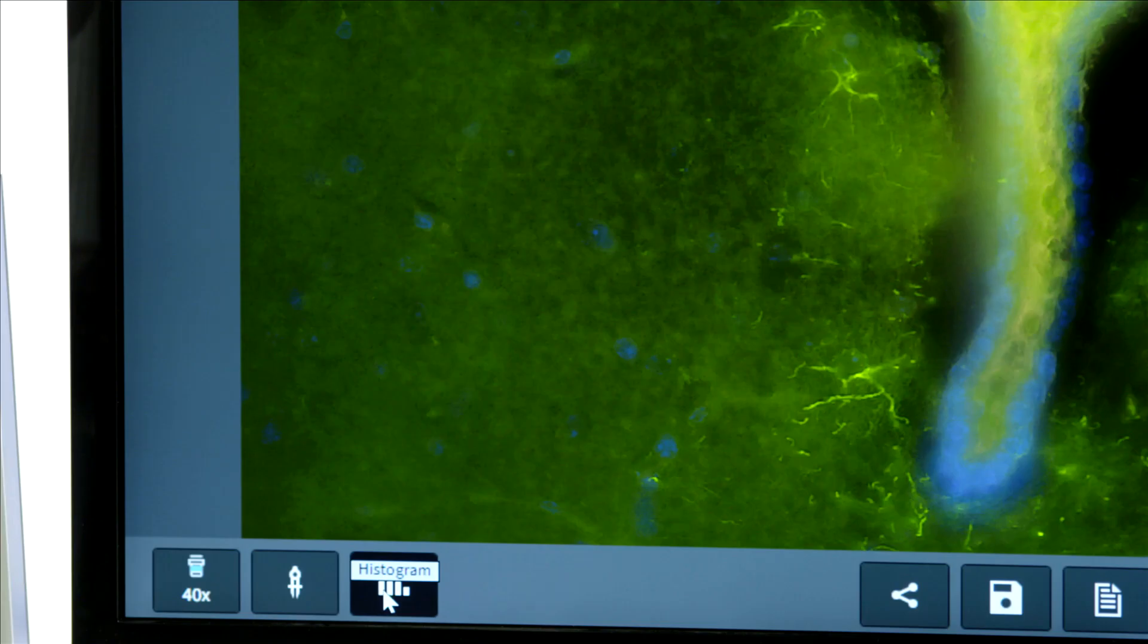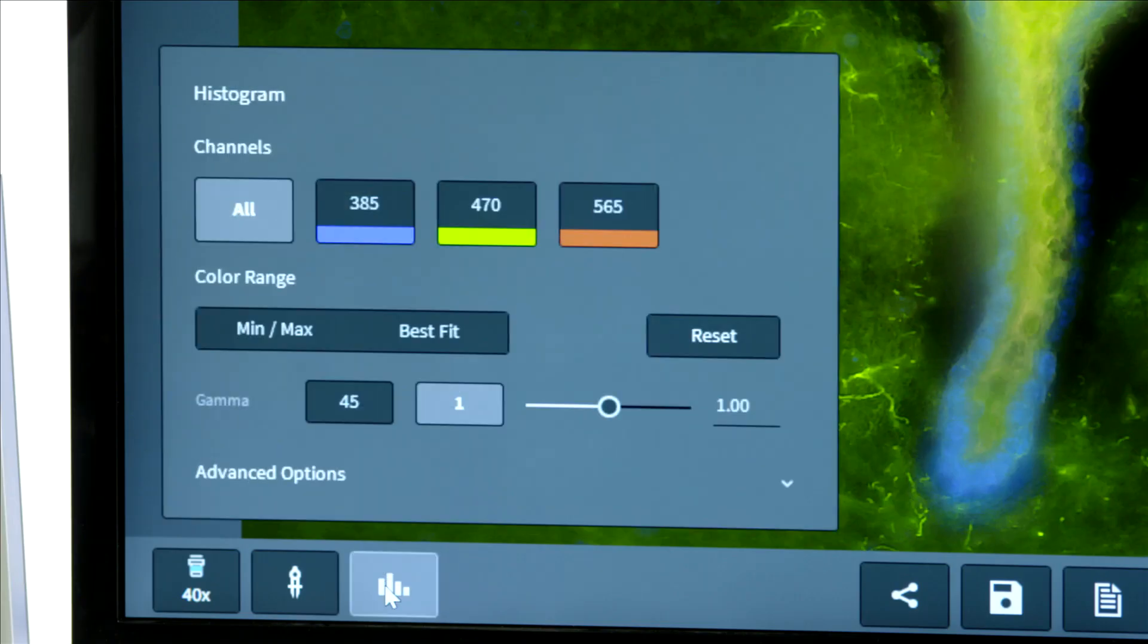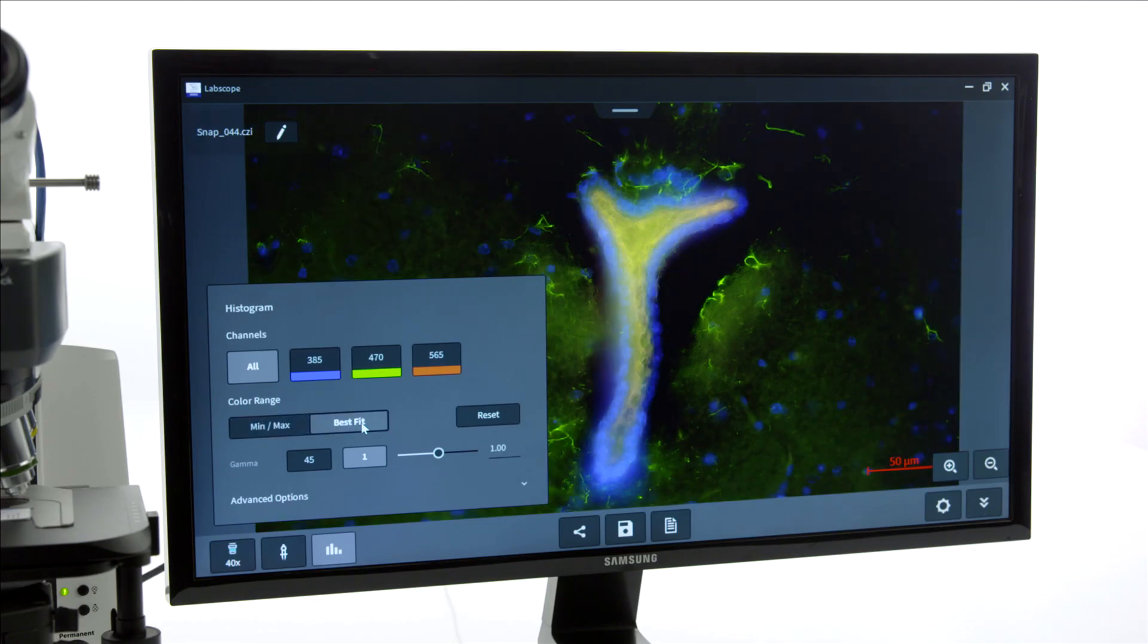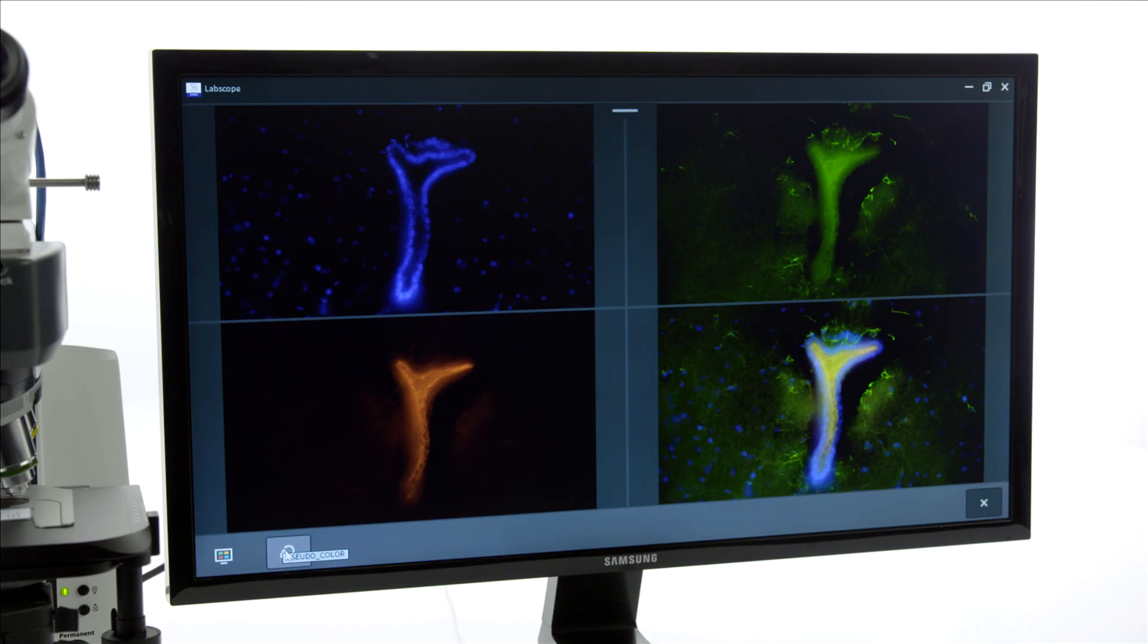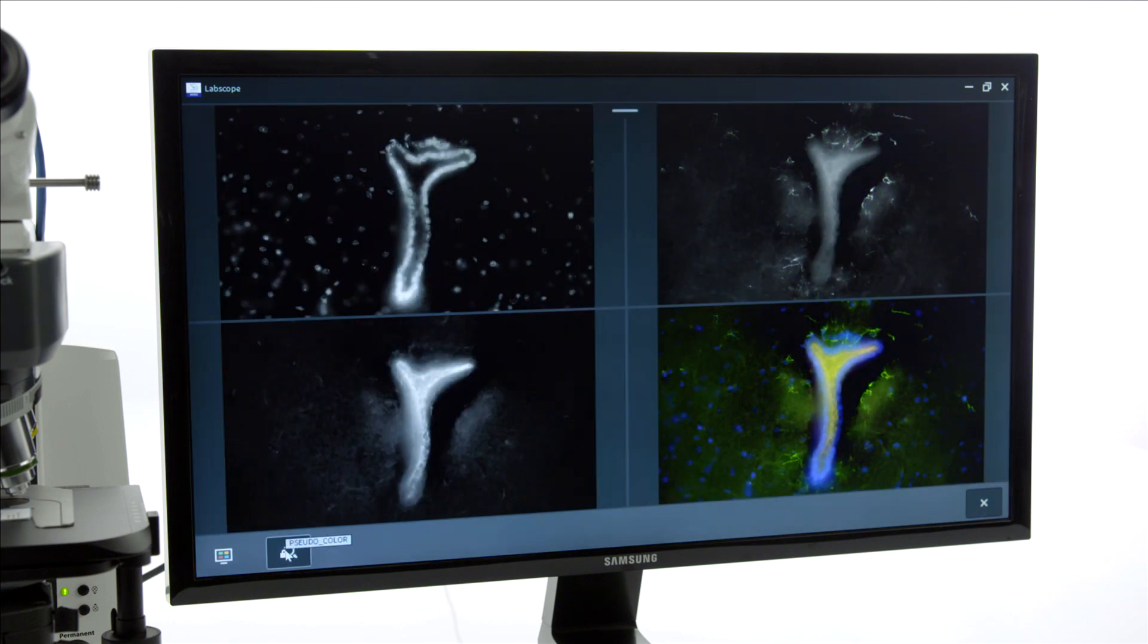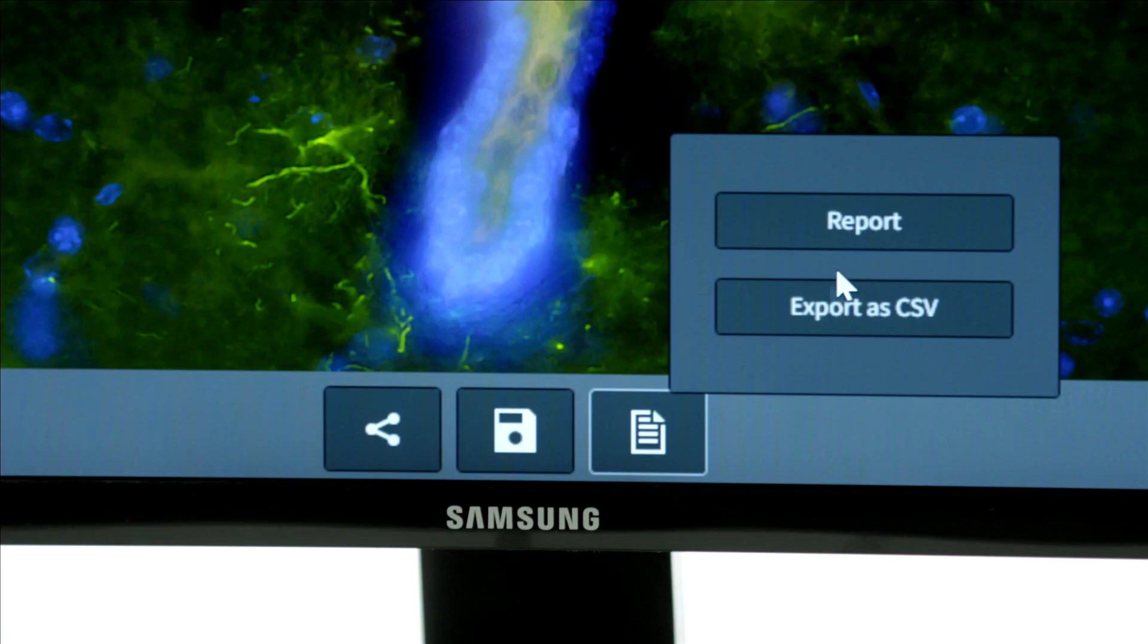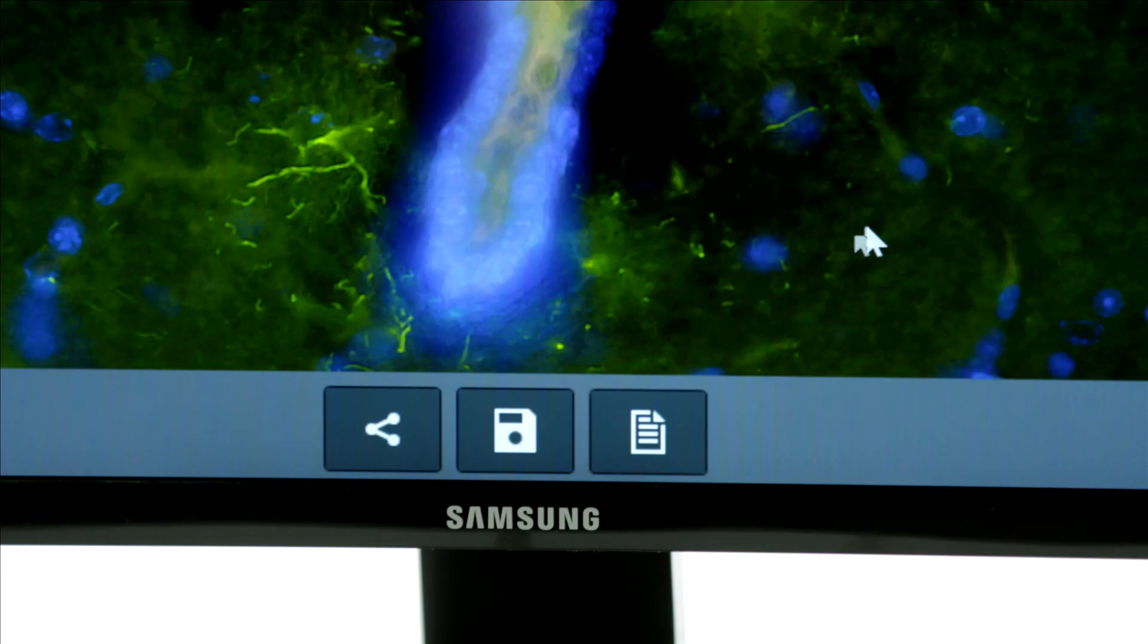With the multi-channel module in LabScope, you can adapt the histogram, compare separate channels and even include them in a report.